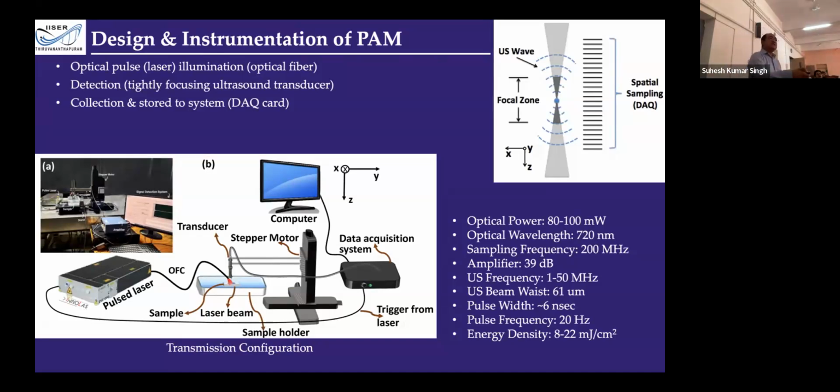At one scanning point we get the 1D data. If we scan along one direction, it will give the 2D data, and if we scan in 2D, then it will give the 3D data. So by scanning the sample with this holding unit that is connected to the stepper motor, we can get the image of the samples. This is the raster scanning based imaging technology.